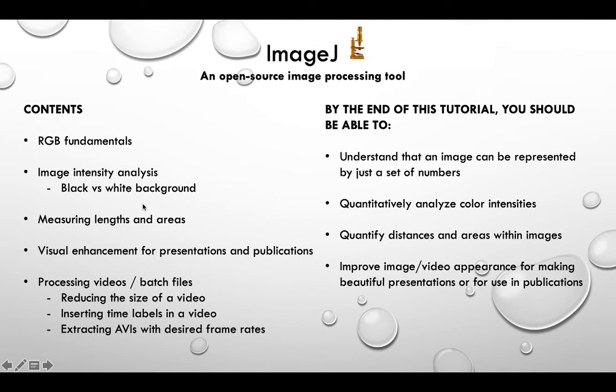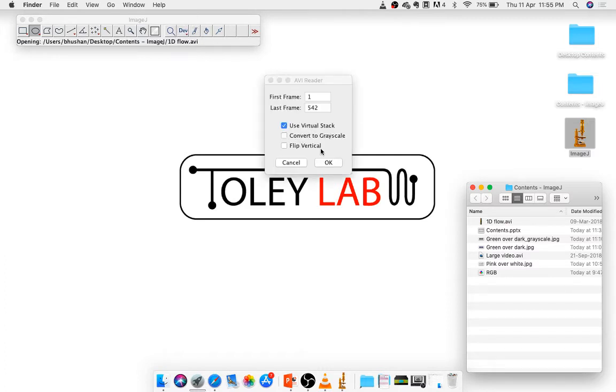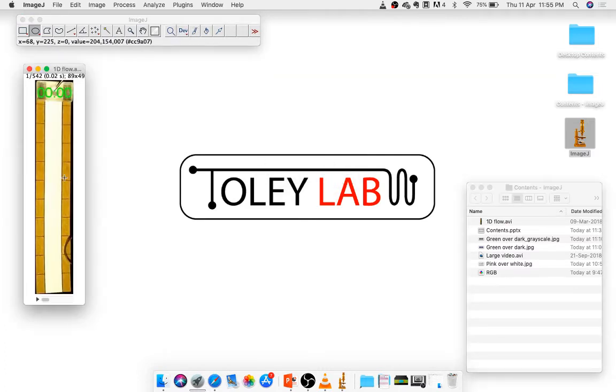Okay, moving on. We'll now look at measuring lengths and areas within the image. So far we were quantifying intensities. Now we are interested in quantifying distances. So let us take a video where this is a 1 centimeter wide strip in which fluid is added over here. It's kept horizontal, and as the video rolls, you will see that the fluid is getting wicked. And my purpose is to now measure the distance traversed by the fluid front as a function of time.